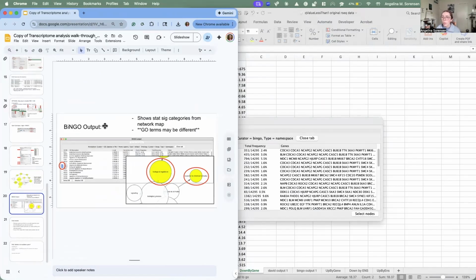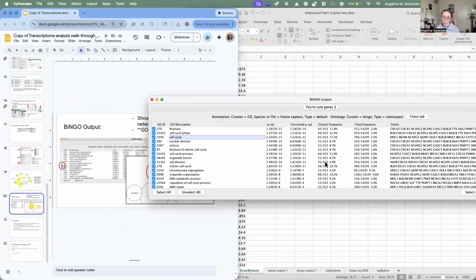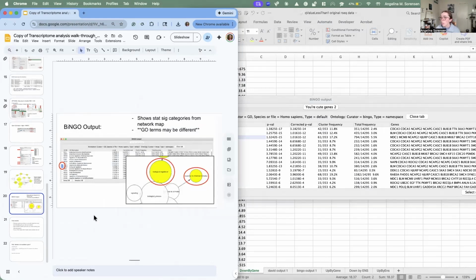So what it looks like in this slideshow probably isn't exactly what this looks like, and it's not going to be exactly what it looks like when you do it, such is the nature of science, and that's okay. So don't worry if yours looks different than your partner's, if it looks different than mine, as long as you're seeing the same kinds of windows and the same kinds of steps, chances are you're on the right track.